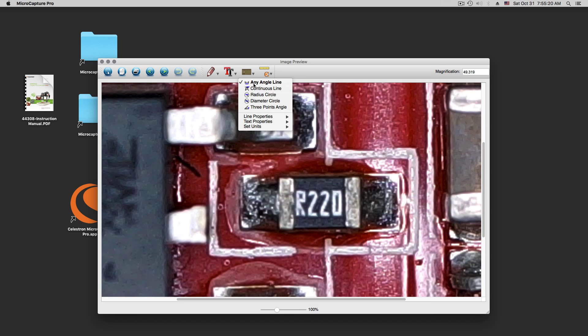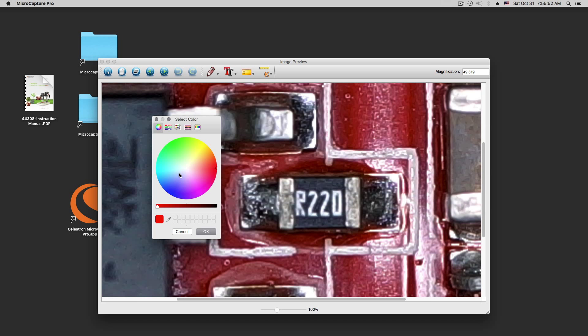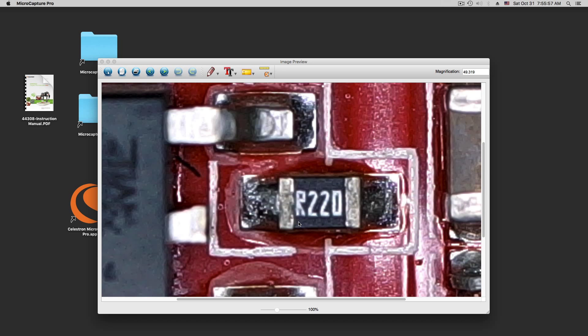And you can do an angle line, continuous line, a radius, circle, line properties, text properties, units, choose your font, solid line. Since we have a lot of red in the picture, we are going to go with the green line here.